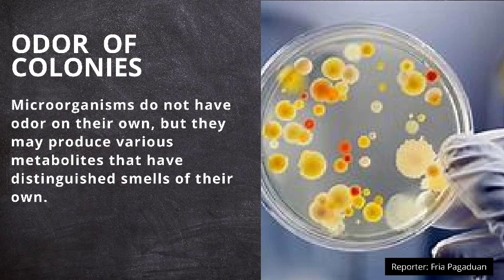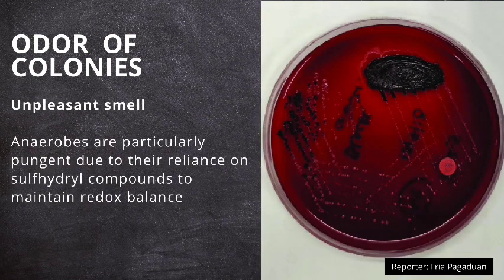Unpleasant smell: anaerobes particularly have an unpleasant smell due to their reliance on sulfhydryl compounds to maintain redox balance. So here we have five examples of microbes and their smell.